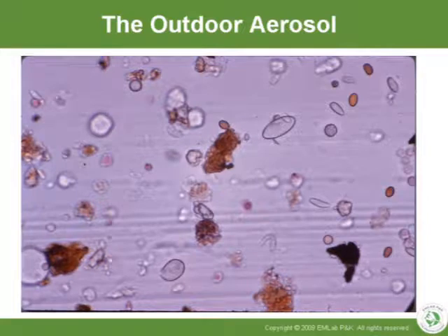The next slide is also the outdoor aerosol, and this is early in the morning when the mushroom spores, basidiospores, become abundant in the outdoor air. So think about this. You get up in the morning, you go out, you collect a sample early in the morning, and the highest concentration is of basidiospores. And these may be in very, very high concentrations too. I've seen them in concentrations as high as 500,000 spores per cubic meter of air.